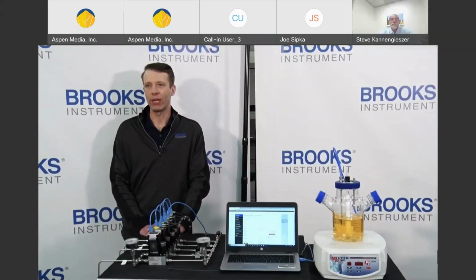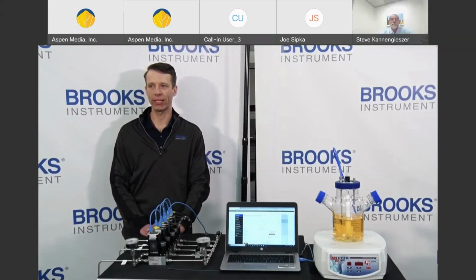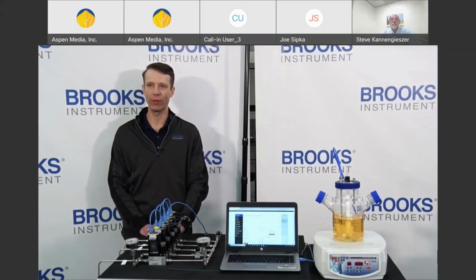The following graph shows how a bad zero can directly impact the MFC's accuracy. The MFC will react to a bad zero by adding or subtracting the zeroed flow from the applied set point, which will show up as flow error during an accuracy check.